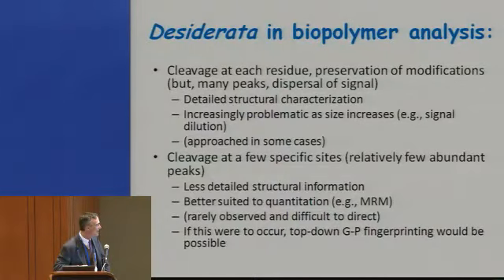It might be better suited for quantitation using single or multiple reaction monitoring. You do see sometimes aspartic acid residue cleavages are predominant with proteins under certain conditions, but it's difficult to direct. But if you're able to do it, then you might be able to come up with what I call a top-down gas phase fingerprinting approach. So let's see.